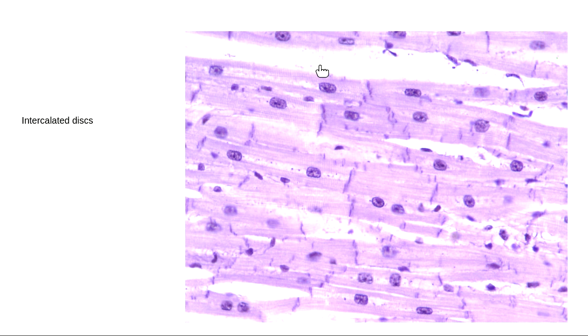Yeah, the reason we see them here in the heart is to act as an energy reserve. So the adipose tissue that you find in between our cardiac muscle cells here, they store energy for the heart. Our heart is constantly beating, right? And so we constantly need energy there.